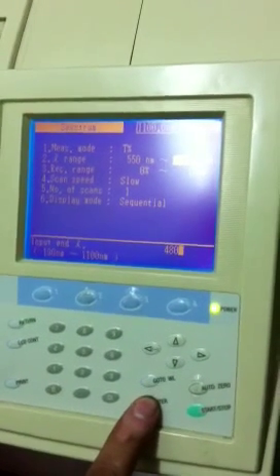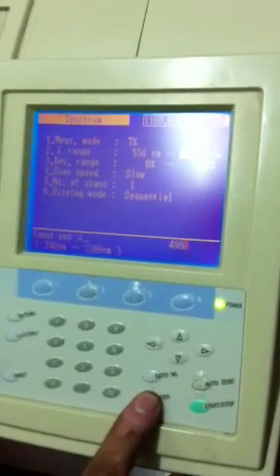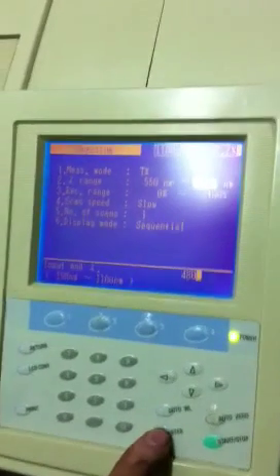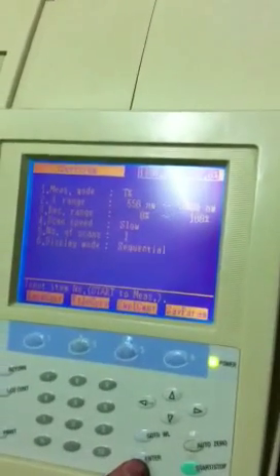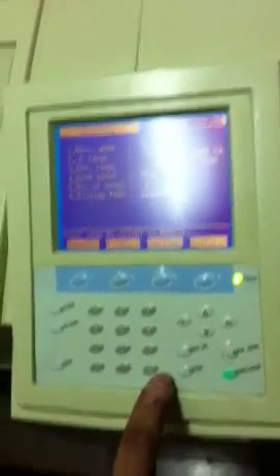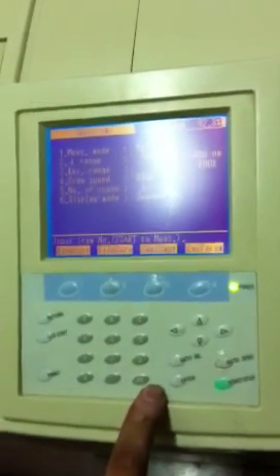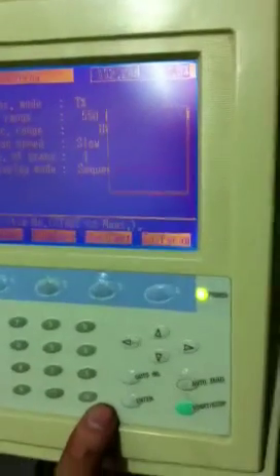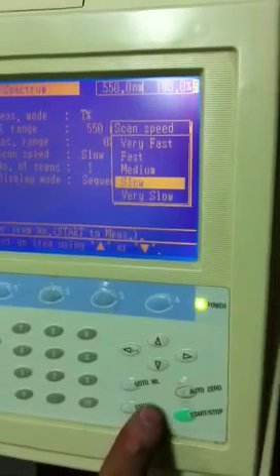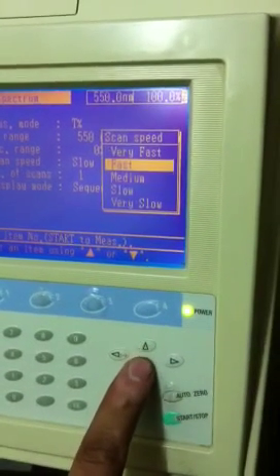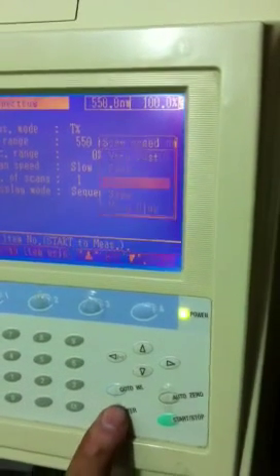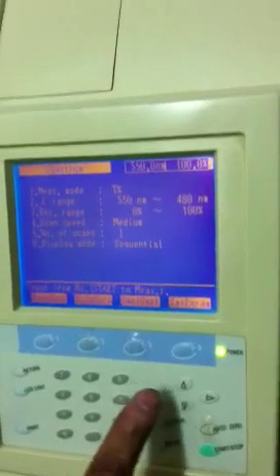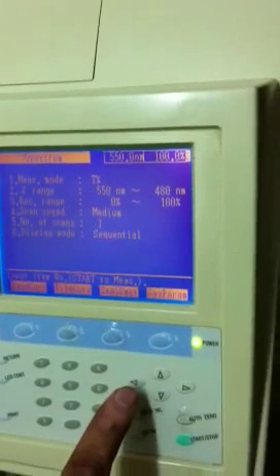Right now we are performing the wavelength calibration testing, just making sure it's up to the mark. That's one of the most important things in a spectrophotometer, you need to check the wavelength calibration. You can select the speed of scanning.